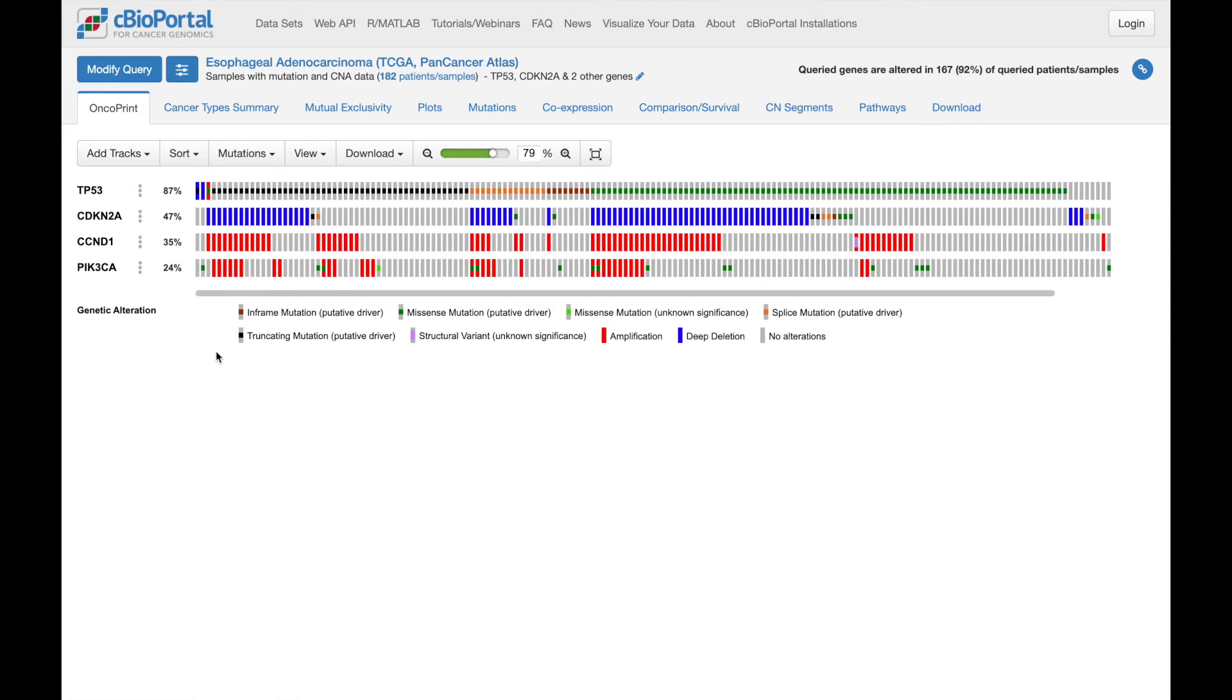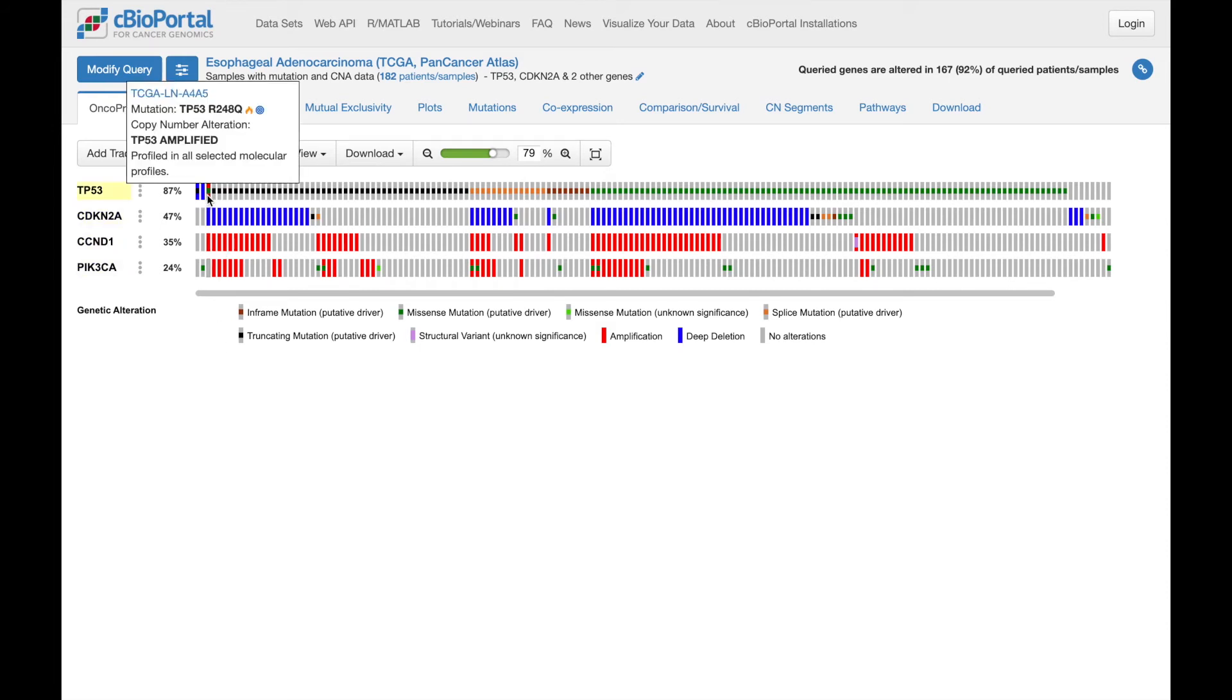The legend below explains the colors used to mark each sample as altered or not altered for each query gene. You can hover over any box in the OncoPrint for more details about the specific alterations represented by that box.